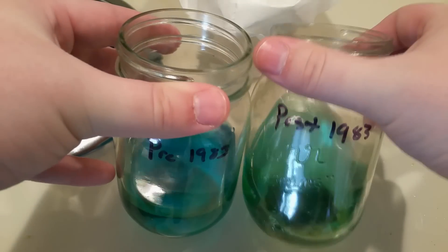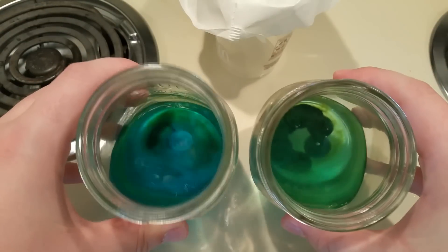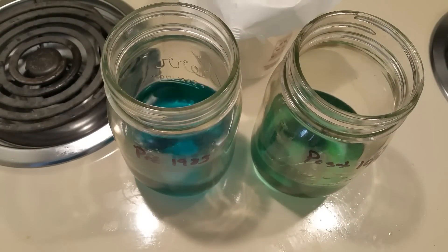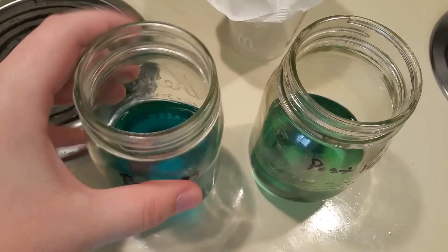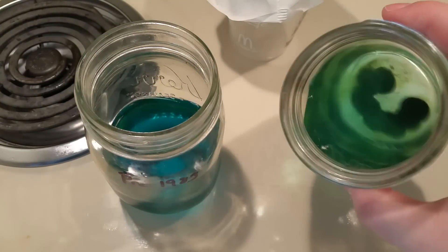This is the next morning, and as you can see, the pre-1983 pennies have actually gotten a lot more blue color than the post-1983 pennies. I attribute this mostly to the fact that there's just more copper in the pre-1983 pennies than in the post-1983 ones.